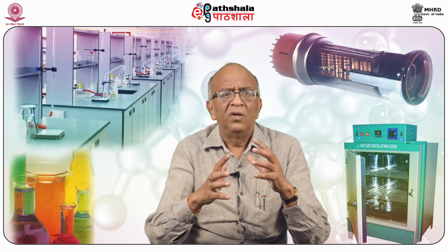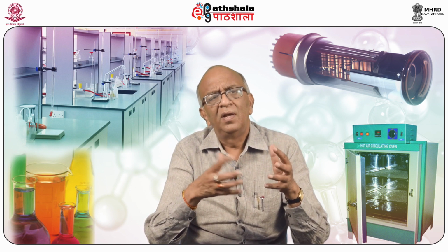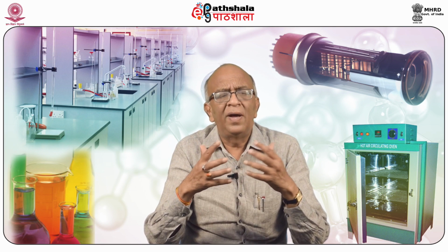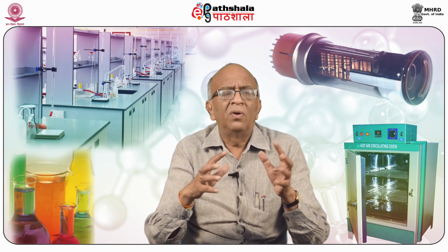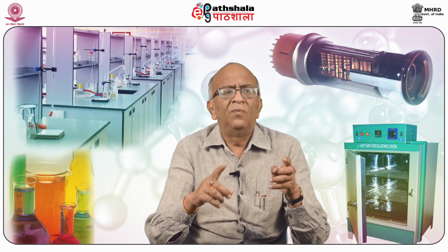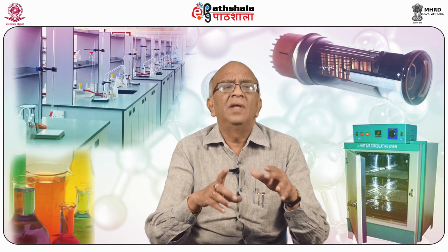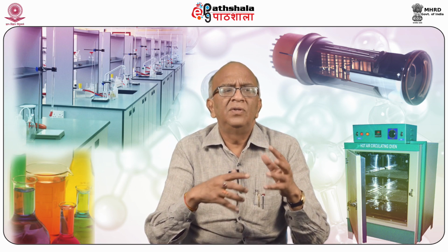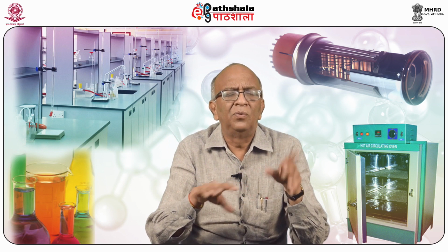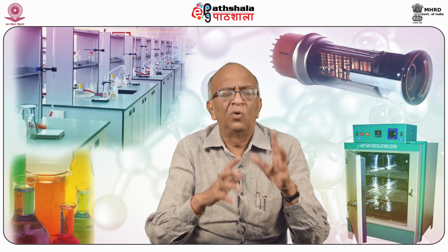With this reagent, you add it to one flask, one conical flask, one beaker, then transfer the same to another one. Like that, in a chain, you may wash, you may rinse your glassware with this chromic acid reagent. Glassware which has not been cleaned to your satisfaction, which still has droplets attached, can be cleaned by using this very stringent and strong oxidizing agent, chromic acid.